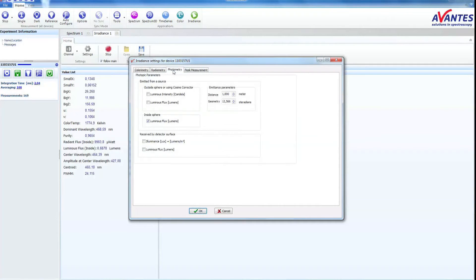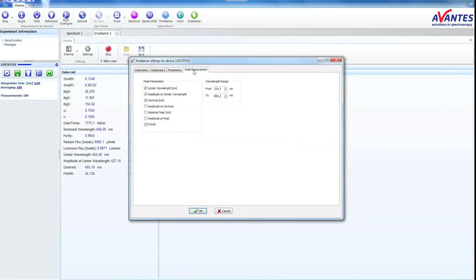Select the parameters for your interest and peak measurements for other LED related parameters.